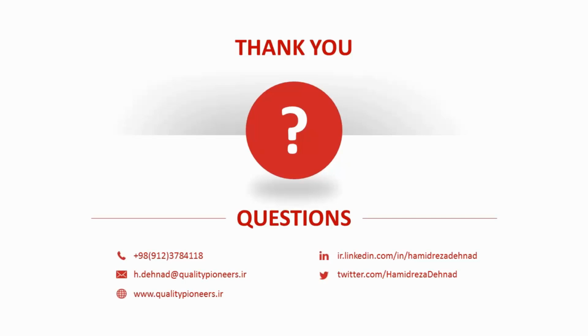The history of that equipment. How important the test is for you. How often do you use your instruments in your laboratory? What is your required uncertainty? What is your customer expectation? What is the manufacturer recommendation? You should consider all of them and define the calibration interval based on your experience. I don't agree with a mathematical and statistical model that gives you a number. The best person and the best approach is that the laboratory technical manager defines it based on the points that I mentioned.